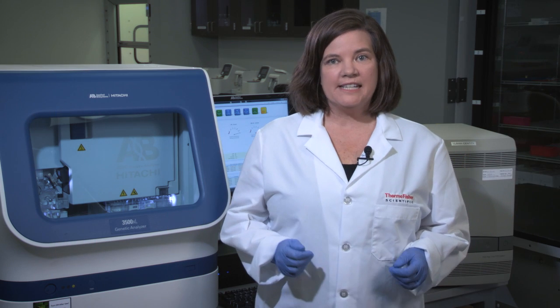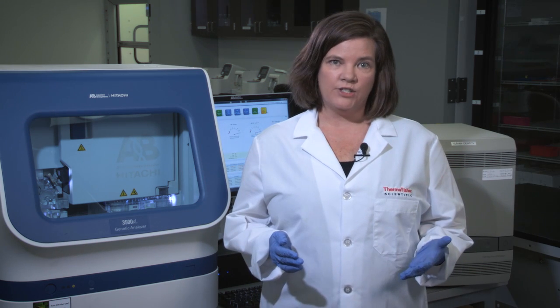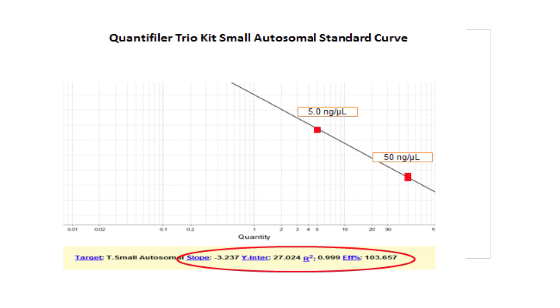Let's take a look at the standard curve for a specific DNA target, the small autosomal target. The x-axis is the log of the known standard concentrations. The y-axis is the CT value of each standard.